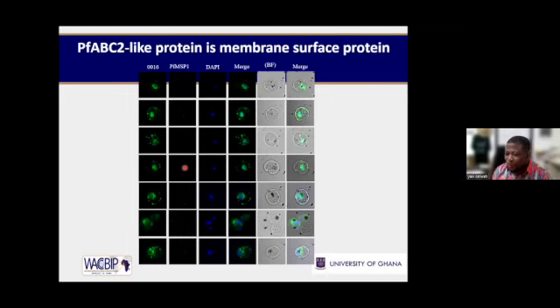What we could do with antibodies generated to this is stain, so if you look from here down, they mature, and this is within a 48-hour period. This is a time point like 4 hours, this is 6 hours, this is 8 hours, this is 10 hours, 12 hours, 14 and 16 hours post-infection.